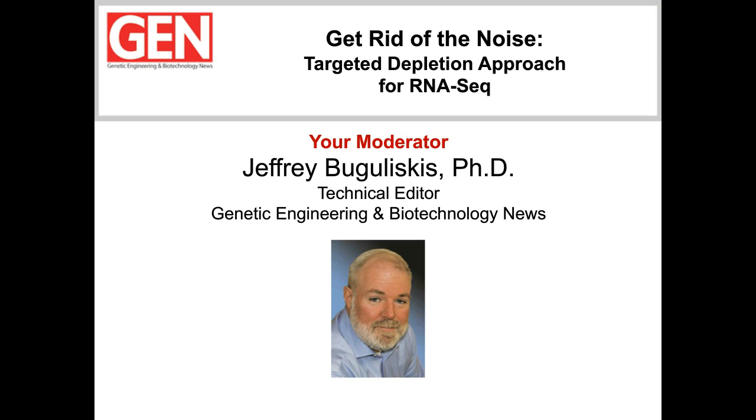RNA sequencing, or as it's often called RNA-Seq, is revolutionizing the field of transcriptomics. This immensely sensitive technique reflects the dynamic nature of gene expression and captures an immense array of biochemical complexity. Yet, for all its intricacies and power, the one thing that makes this next-generation sequencing technique so interesting is the very thing that makes it challenging, RNA.